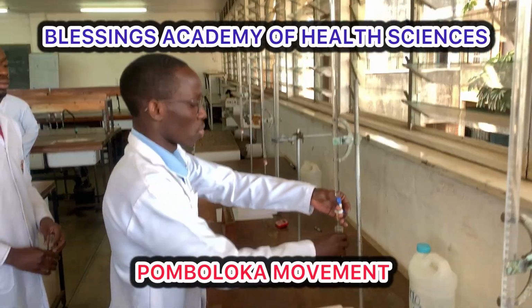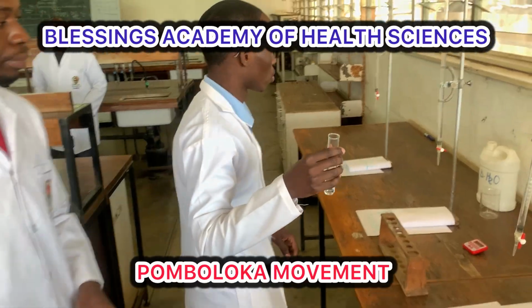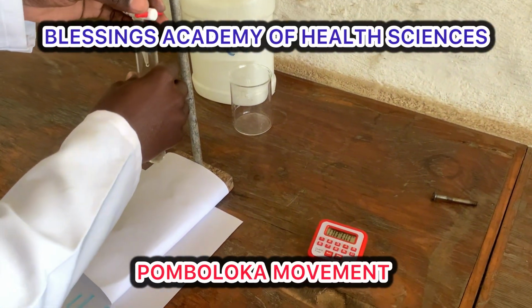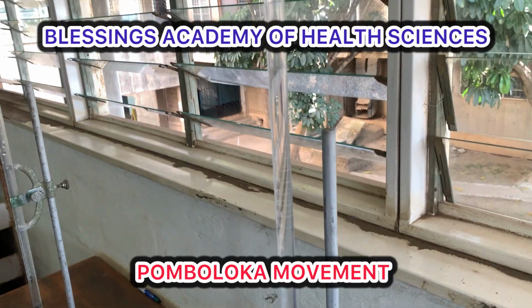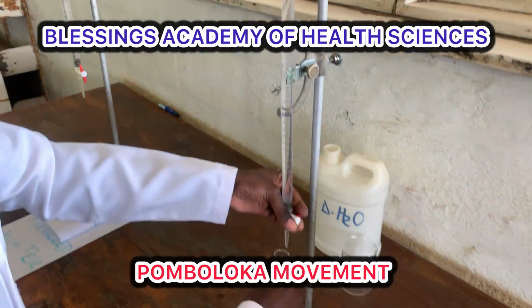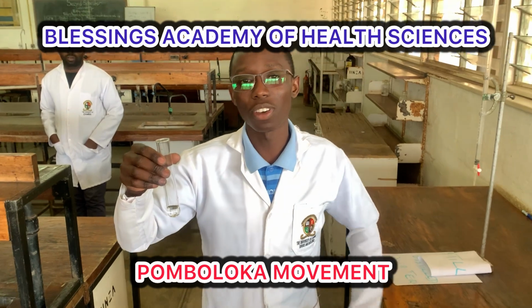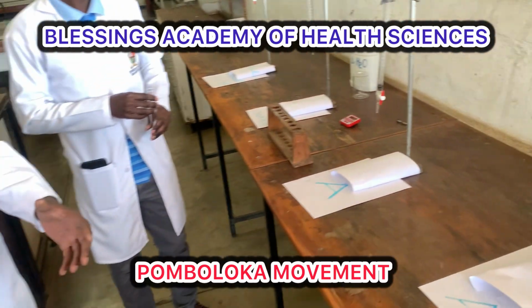Okay. So we have 4.5 mils of sample A in the test tube. So to 4.5, we're now adding 0.5 mils of distilled water to make it 5 mils. So just a bit. Okay. So in total, we have distilled water of 0.5 and 4.5 mils of sample A, making 5 mils of solution A. Perfect. So we've collected the first part.